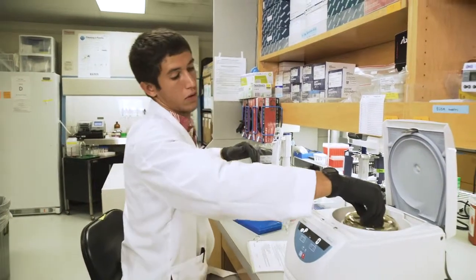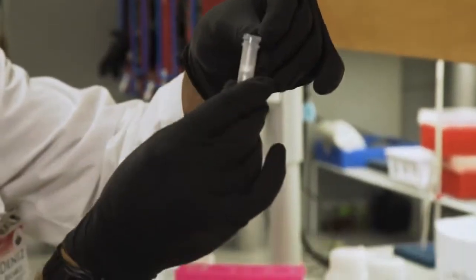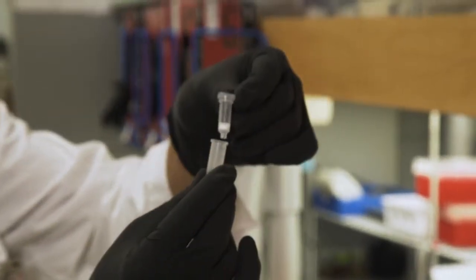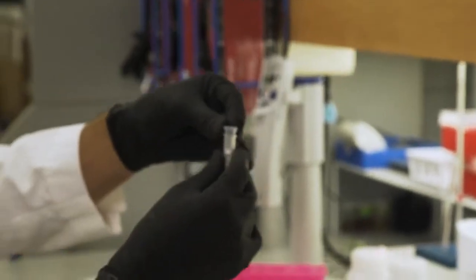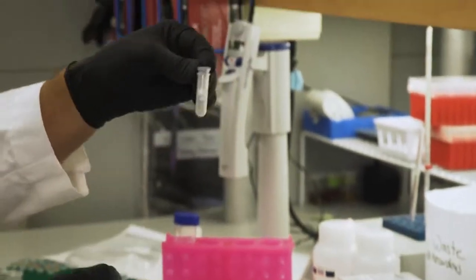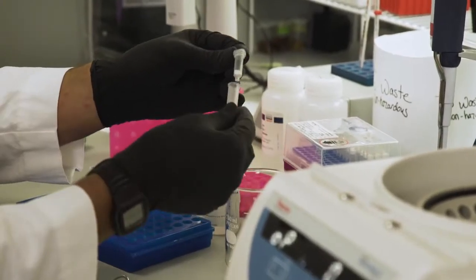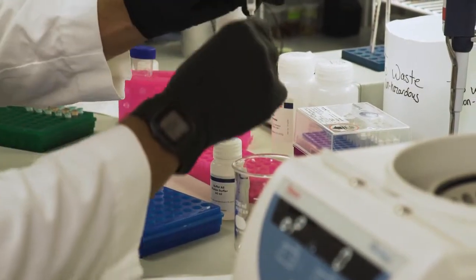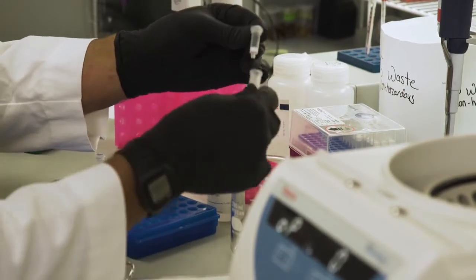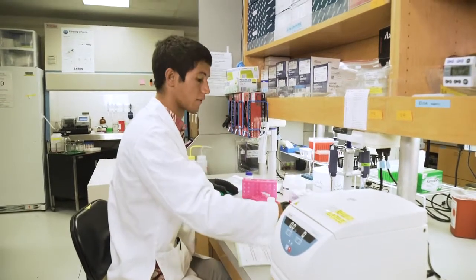So those go there. We pull our lid off, and we pull out our freshly spun tubes. If you saw going in, the liquid was in the top, and now it's in the bottom. So we're going to take that, dump the liquid out into our waste vessel, and since we still have more junk to wash through, we're going to just use the same collection tube. At the very end, when we're collecting the DNA after the addition of the elution buffer, we'll use a new collection tube that doesn't have any residual, because you dump most of it and there's always a little bit of liquid left in. All right, so we dumped everything, close that again so nothing falls in there.